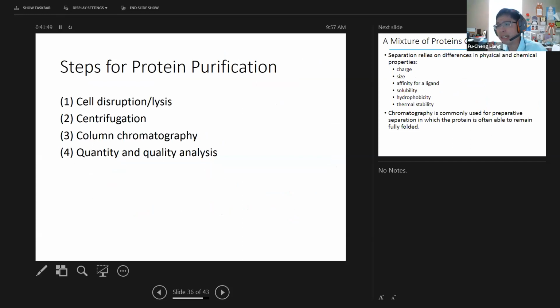And of course, in order to study this protein molecule, usually what we do in the lab is use some bacteria, or some yeast, or some different kind of organism to express the protein. And then once the protein is expressed inside the bacteria or inside the yeast, there are tons of proteins there, and you need to fish out your target protein. One way to fish out your protein is protein purification, all right? And this purification makes sure that in the end your protein is very pure. Then you can study this protein-protein interaction by using the fluorescence technique we have been talking about.